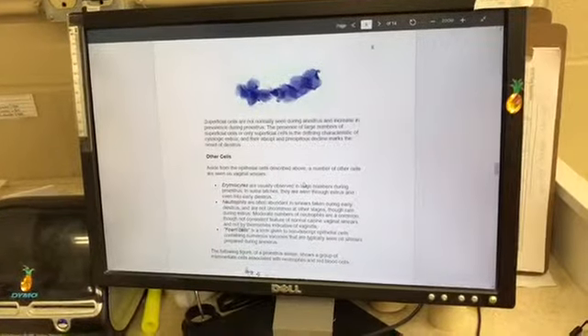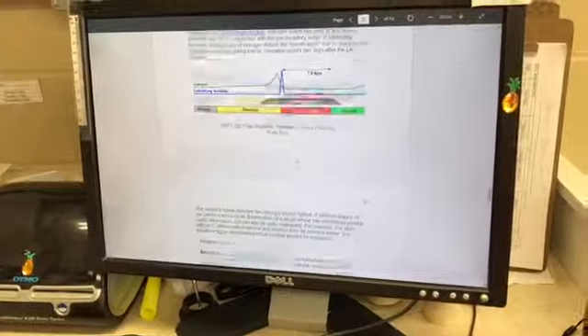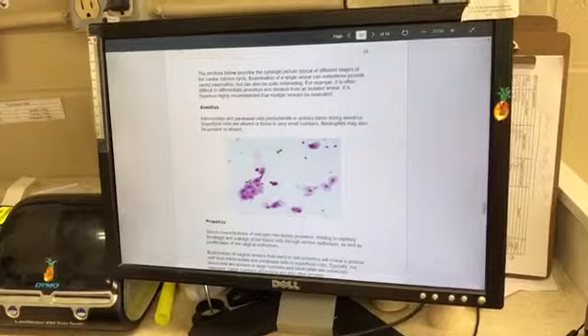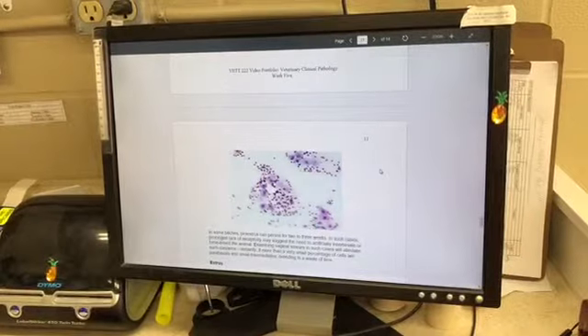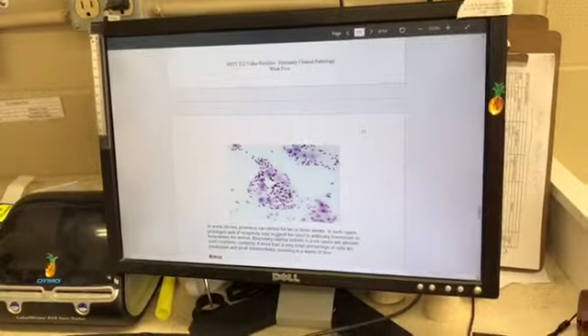The next thing I want to talk about is the predominant cells seen during different stages of the estrous cycle. I do have some pictures. This is the anestrous stage — you'll see intermediate and parabasal cells in that stage. And then in the proestrous stage, you're going to see a gradual shift from intermediate and parabasal cells to superficial cells, with red blood cells and neutrophils also present.